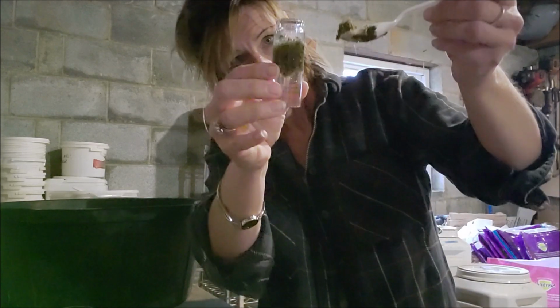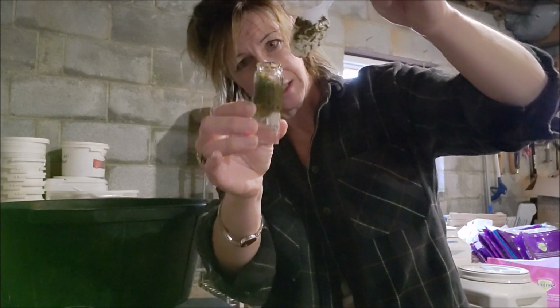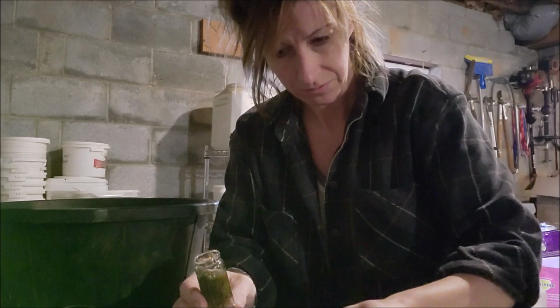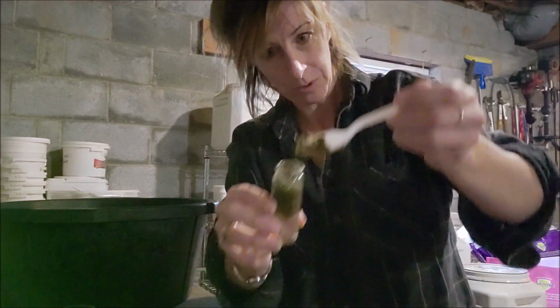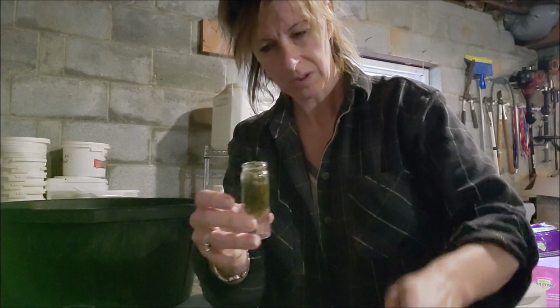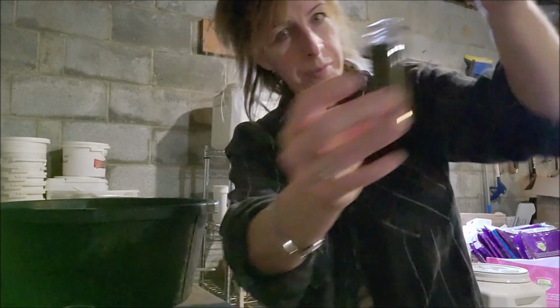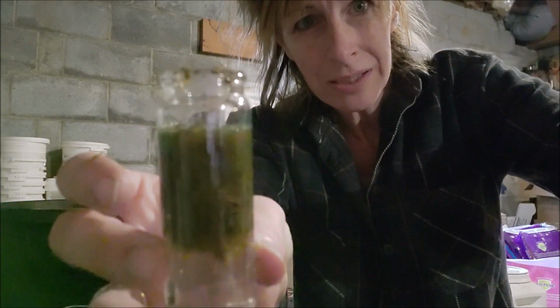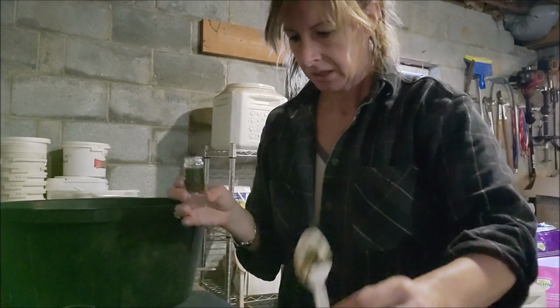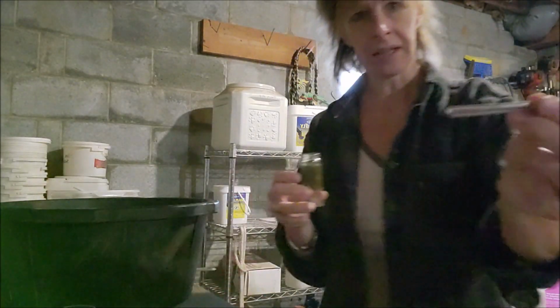There we go. And what happens is, as you're doing this, you're increasing the height of your solution, because obviously you're adding stuff to it. So you don't want to add too much. There we go. Let's turn this around. And are we on the line? Yep, I think we're right there on the line where we need to be. Sorry if it's blurry. Okay, so this is the fun part. Throw this one away. And then I have another one.